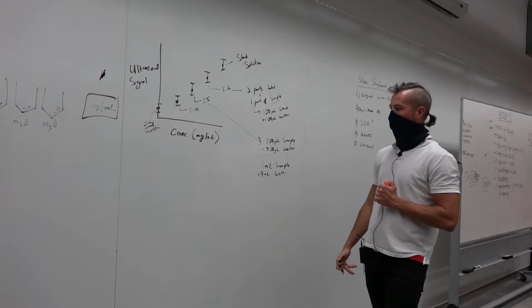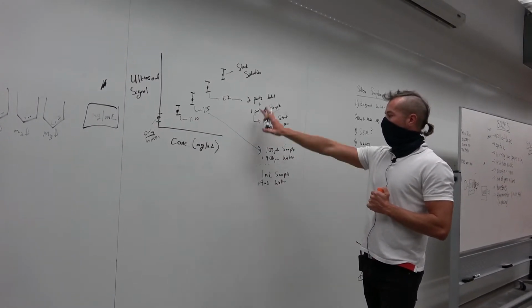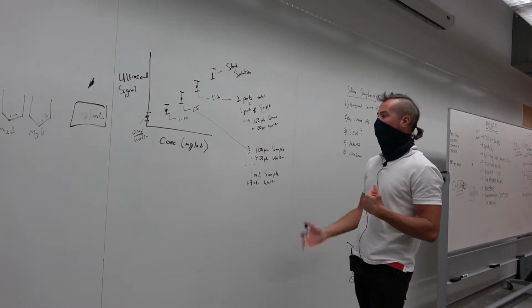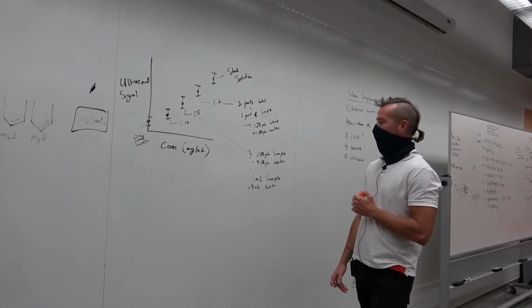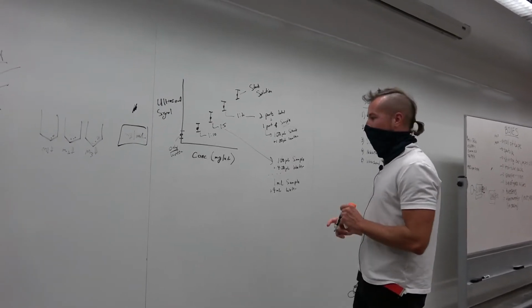Okay? So these are the solutions that I am going to make and have you watch me make them.